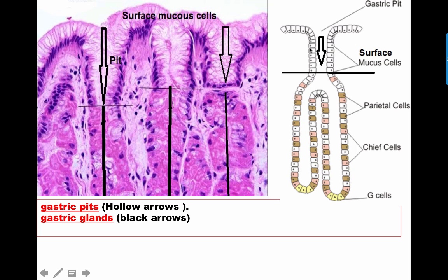The surface epithelium mucus cells are tall columnar cells with basal oval nuclei. They have an apex full of vacuolated material representing the accumulated mucus in these cells. This mucus lines the mucosa to form a protective layer against the gastric acid (HCl). These surface epithelial cells are also present as the lining for the gastric pit.